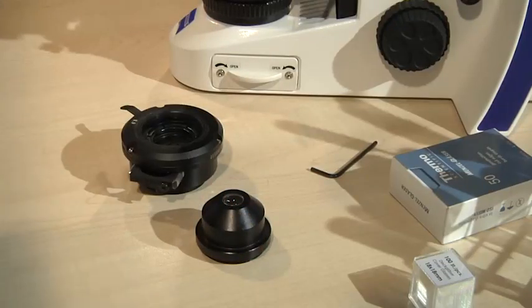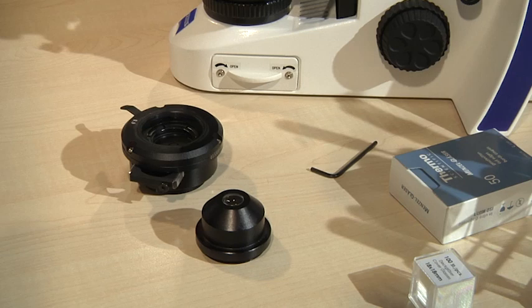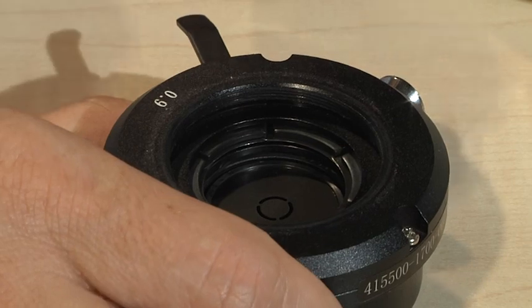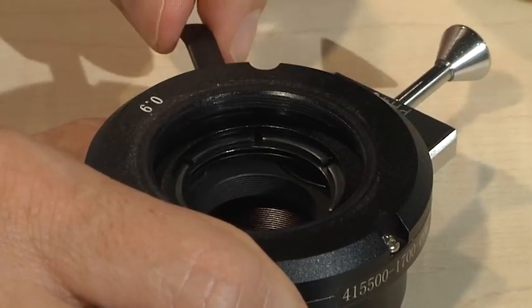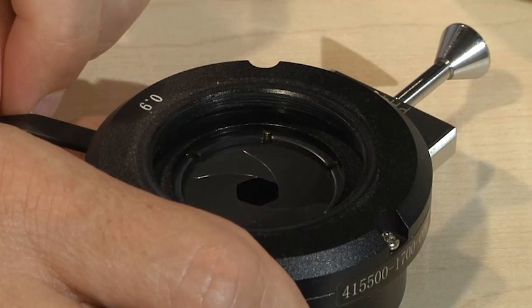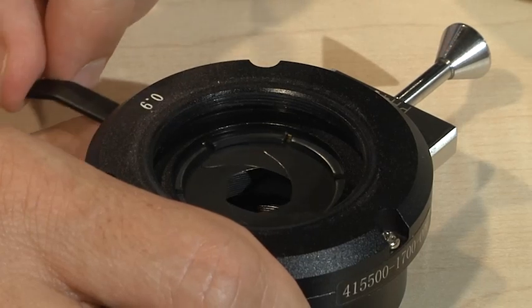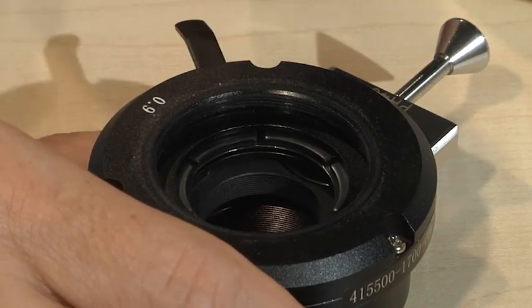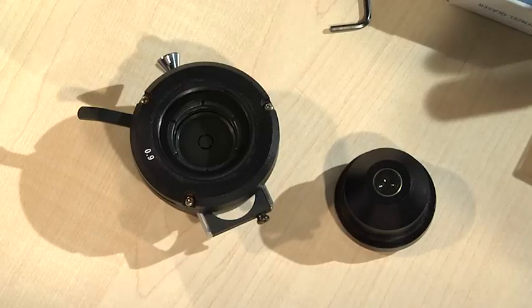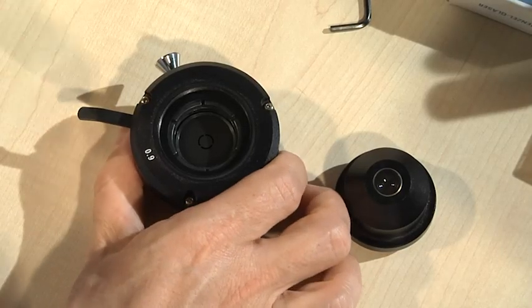This is the demounted condenser. A simple Abbe condenser consists of one or two lenses and a condenser aperture diaphragm placed below these lenses. Alternatively, the condenser annulus is placed here. The condenser annulus is part of the phase contrast system, which is particularly important for visualization of living microorganisms.